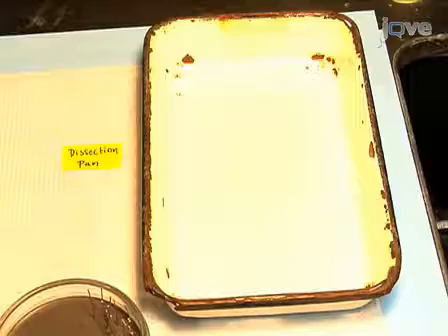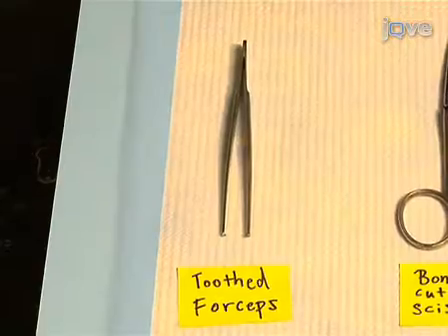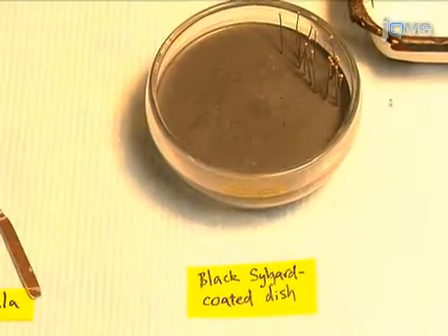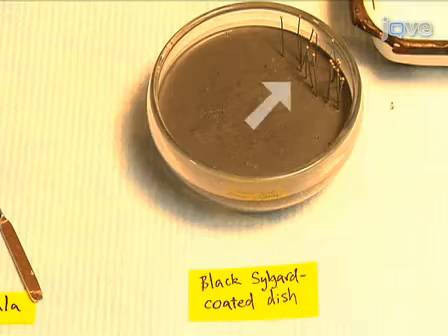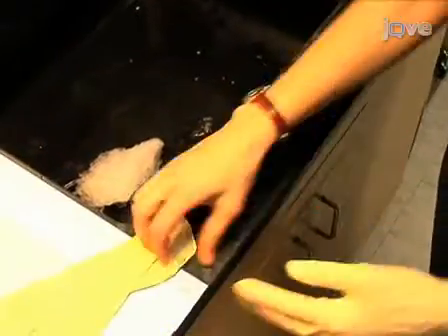The required equipment includes: the dissection pan, rondures, bone cutting scissors, small scissors, toothed forceps, a spatula with a tapered edge, a black silgard-coated dish, and insect pins. Before beginning, prepare yourself by donning gloves.